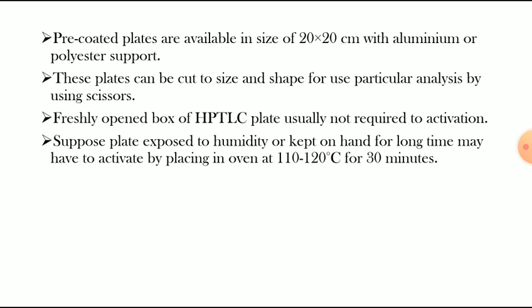Suppose our fingerprint is observed on the plate when we handle it, at that time we have to activate the plate in the oven at about 110 to 120 degrees Celsius for 30 minutes, to avoid contamination in the separation of the sample components.